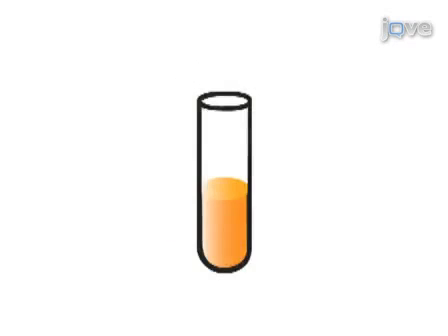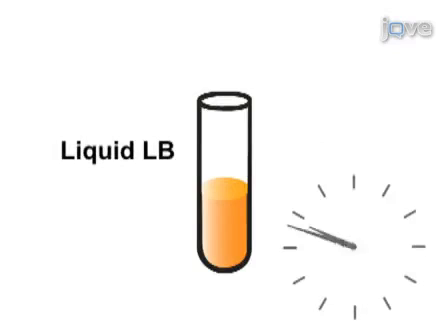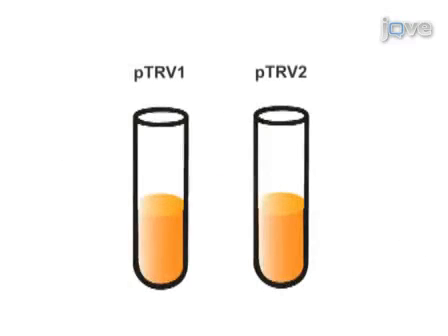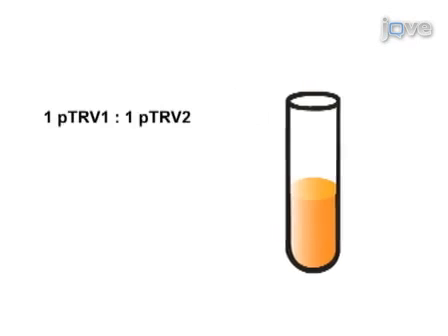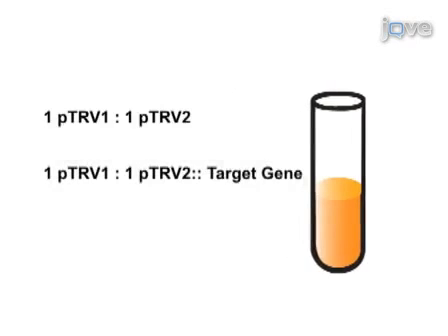Two days later, these strains are inoculated in liquid LB and grown overnight. This culture is then used to inoculate a secondary induction media liquid culture, which is also grown overnight. The next day, a bacterial suspension of each culture is prepared and both PTRV1 and PTRV2 or PTRV2 target gene are mixed in a one-to-one ratio.